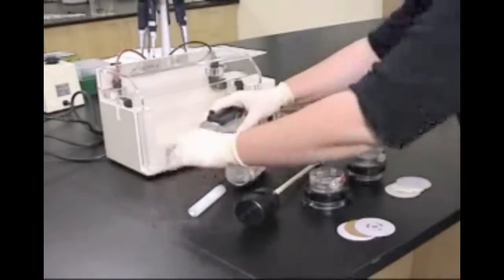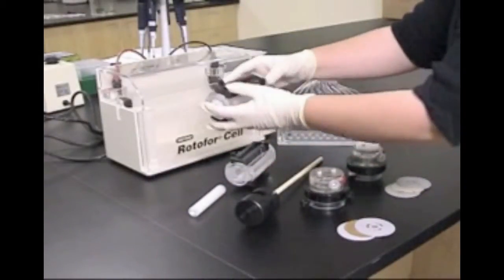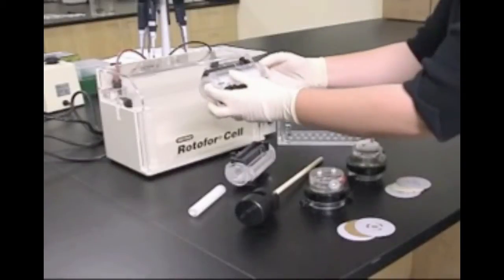A membrane core fits inside each focusing chamber to separate it into 20 fractions or compartments.